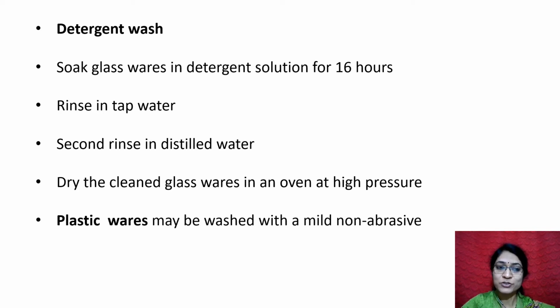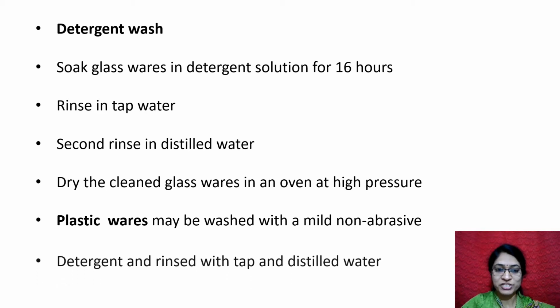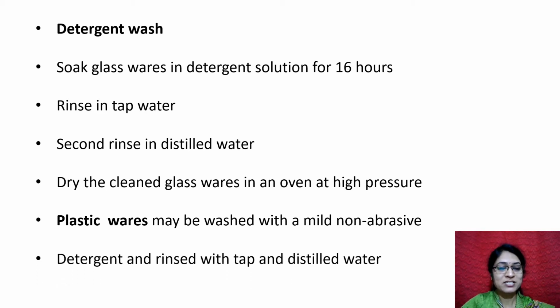Plastic wares may also be used in the laboratory, and these may be washed with mild non-abrasive detergents. After washing with detergent, we must rinse with tap water, later with distilled water. Then those plastic wares and cleaned glasswares can be kept in dust-proof cupboards, and whenever we need, we can use them for the tissue culture experiments.